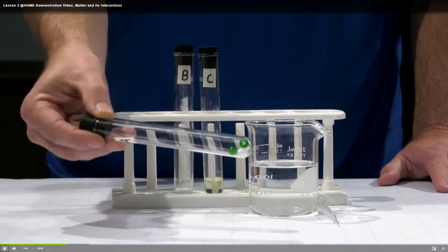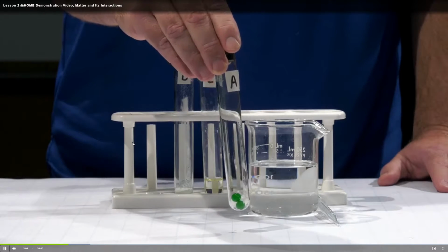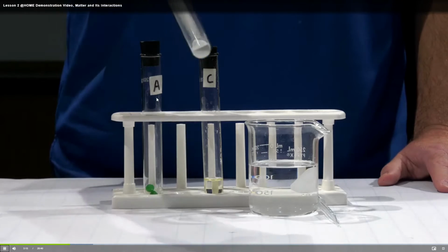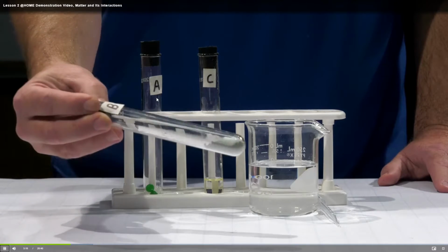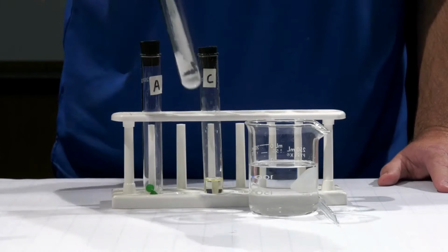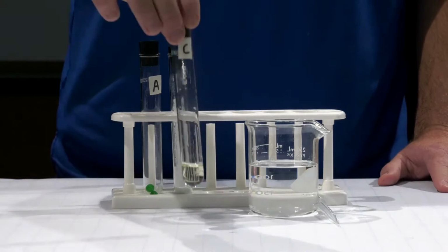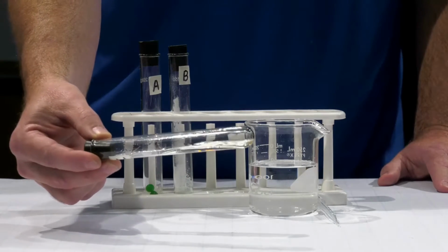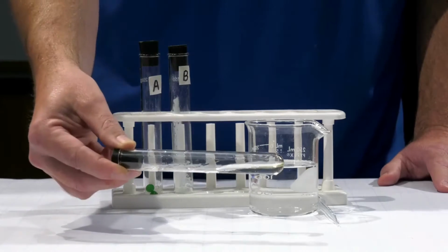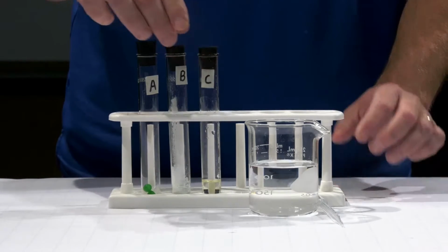Right now we are observing what 3 mystery samples look like. There's a chart for you to fill out. We should be writing down observations, describing what they look like. So we can describe their color, we can describe their textures. Is that fluid thick or thin? Anything you can think of.